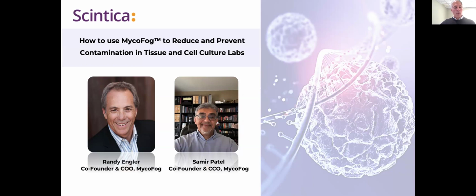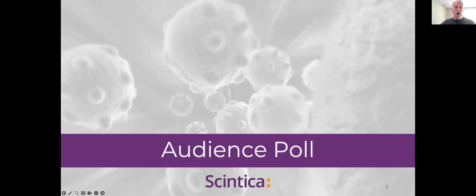Before we begin, we have a couple of quick poll questions that will allow us to better understand how you currently go about decontaminating your cell culture incubators and glove boxes. We're launching a poll. You should see 2 questions. The first question is, how often do you clean and decontaminate your incubators?